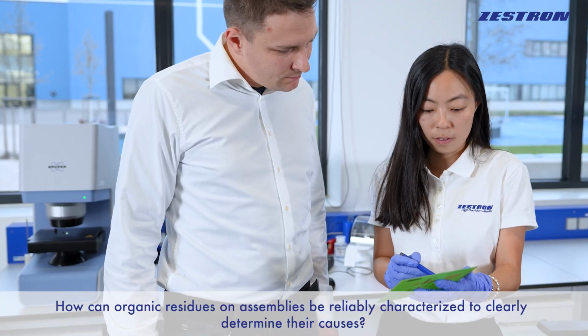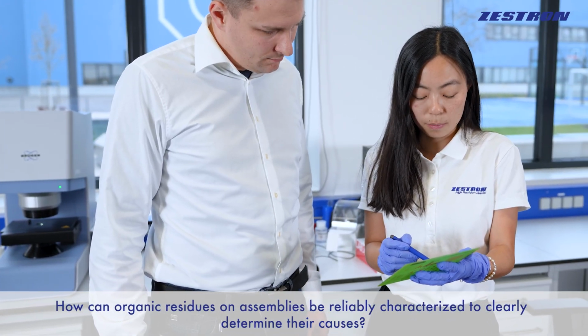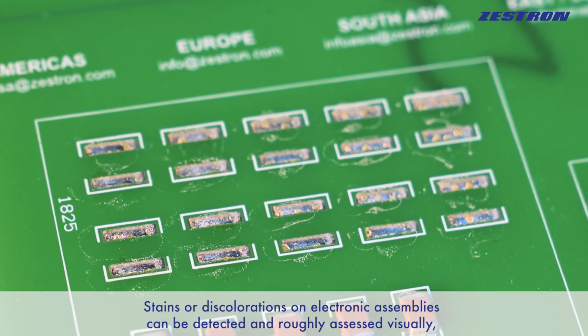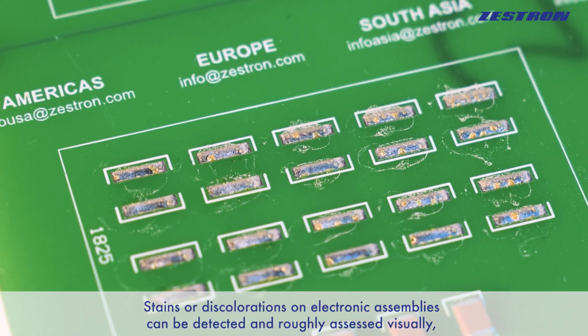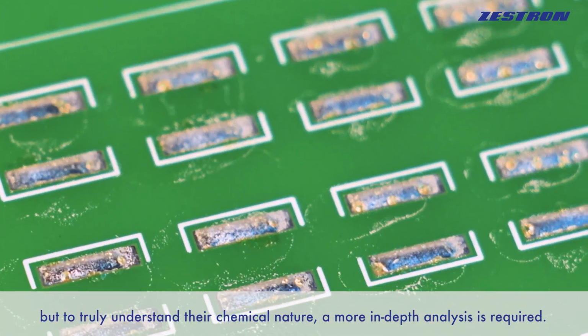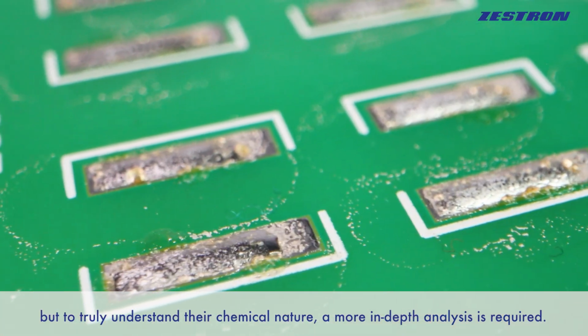How can organic residues on assemblies be reliably characterized to clearly determine their causes? Stains or discolorations on electronic assemblies can be detected and roughly assessed visually, but to truly understand their chemical nature, a more in-depth analysis is required.